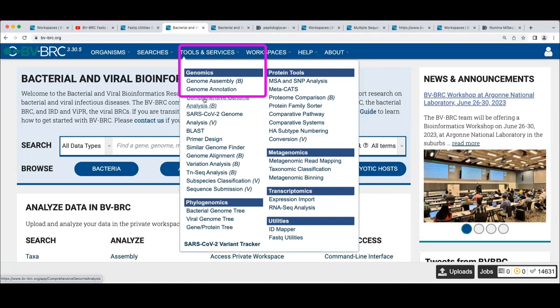These services were originally developed from the bacterial side — they were originally PATRIC services. There are some instances where they will work for viral use cases and some where they will not. We also have a SARS-CoV-2 assembly service that's specifically for assembling SARS-CoV-2; it's mostly up to date but we need to add the new ARTIC primers that came out a week or two ago.